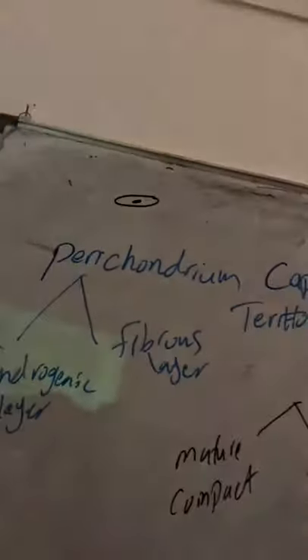What about this layer? This layer contains what? It contains the oval-shaped cell, with a flat nucleus, and this nucleus is found in the center. Is this cell an osteoblast, or what? The chondrogenic cell, it is a chondroblast.